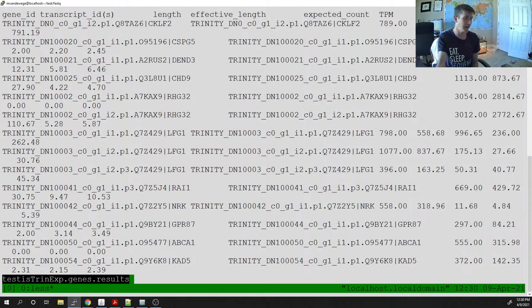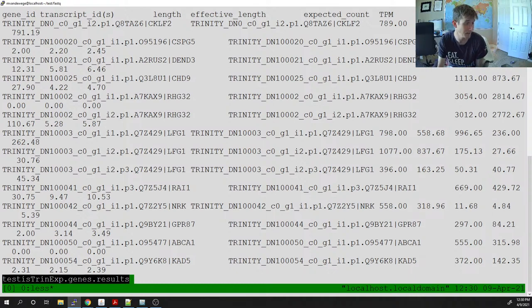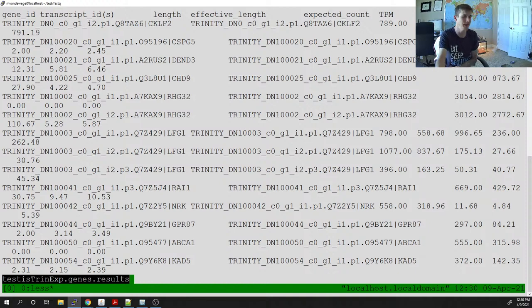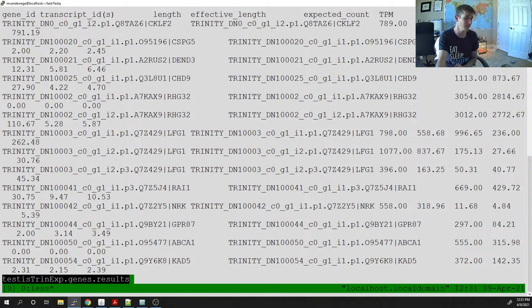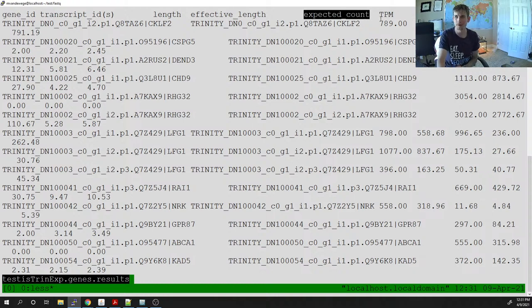The additional metrics are TPM and FPKM. TPM stands for Transcripts Per Million — if there are a million transcripts in a cell, how many came from that gene? In this case, 711 out of a million came from that gene. FPKM stands for Fragments Per Kilobase per Million — it takes into account the size of each gene. My two go-to metrics are expected count and TPM.